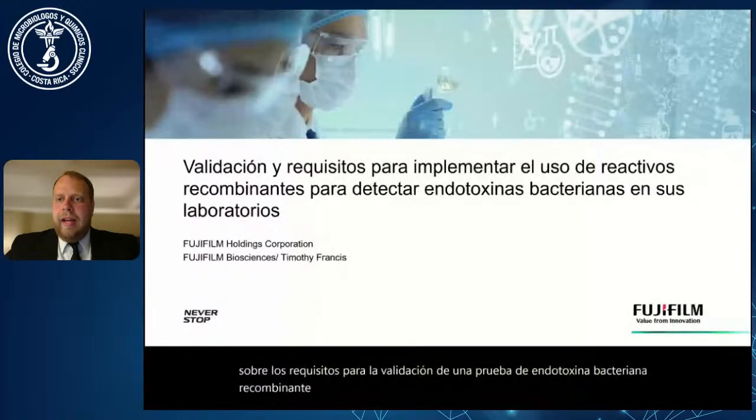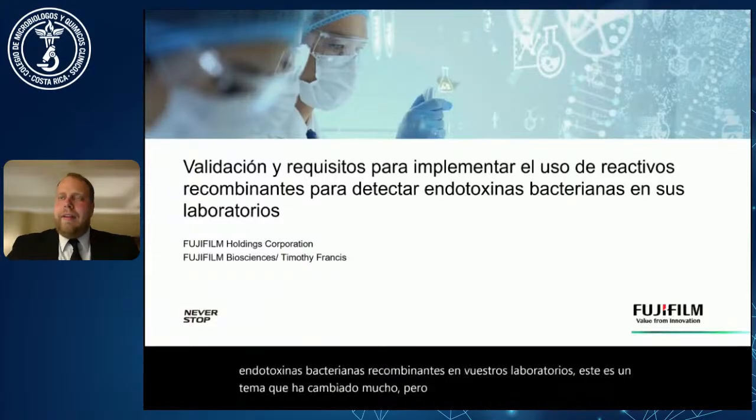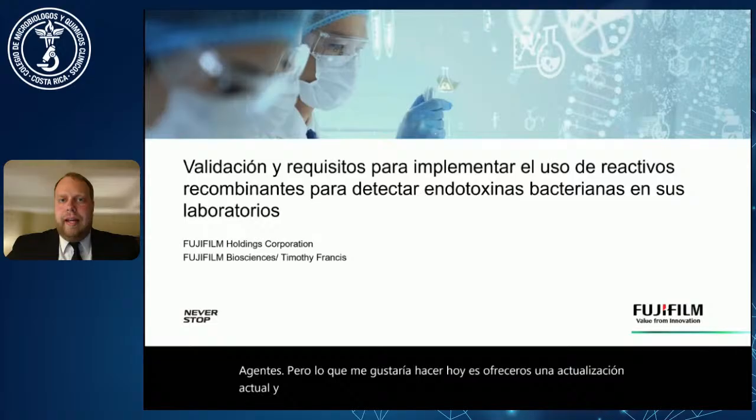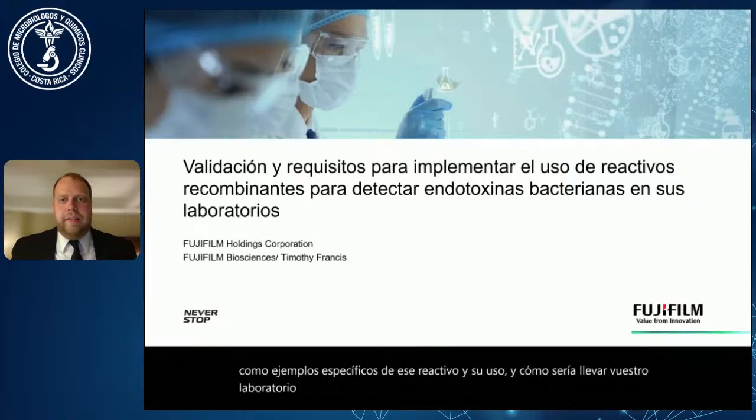This is a topic that has had much change, but also many things have not changed as fast as should be hoped, in terms of bacterial endotoxin testing and animal-free reagents. But what I would like to do today is provide you with a current update and give you examples with the recombinant reagent that my company has, and what it would look like to bring your laboratory to a recombinant bacterial endotoxin test as opposed to the traditional LAL reagent.